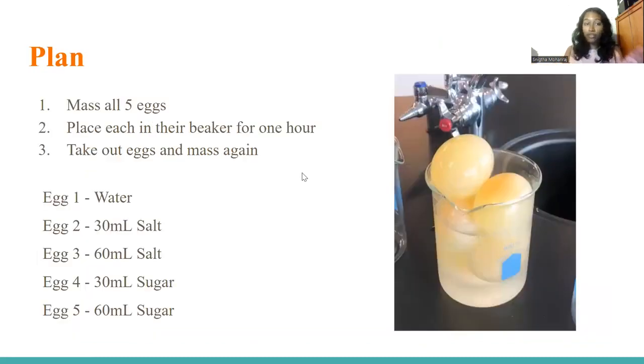So the basic overview, the next part of this project, or any project, is to have a basic procedure so that you understand what you're trying to do. So this is a very basic procedure. Definitely, if we were to write a full lab report about this, we'd want more exact measurements, more exact descriptions on the handlings of the equipment, just to make sure that it is a step-by-step procedure that is easy for anyone else to follow.